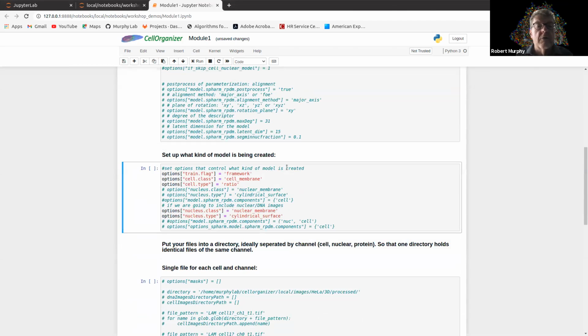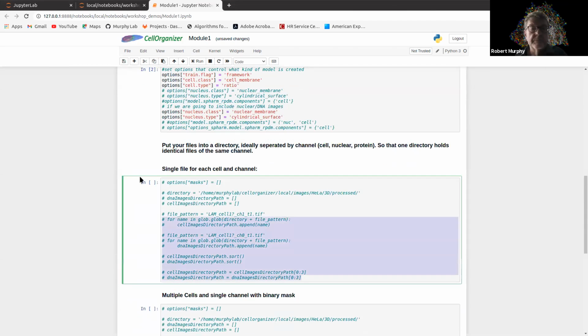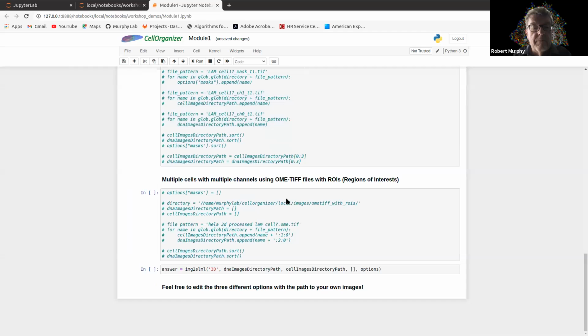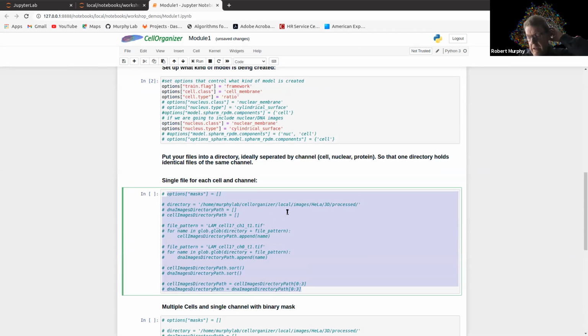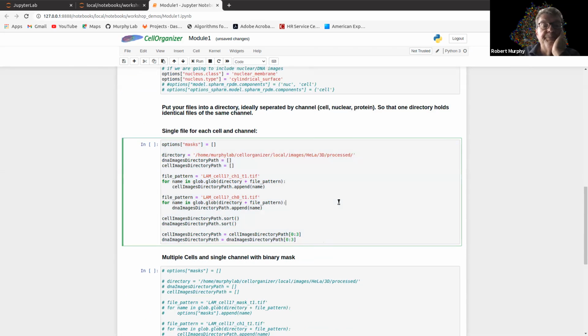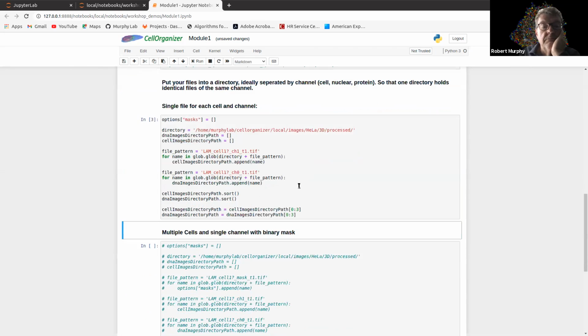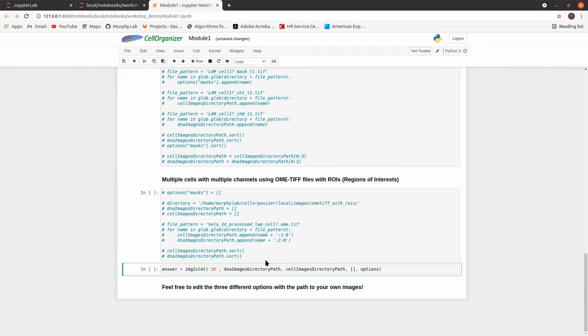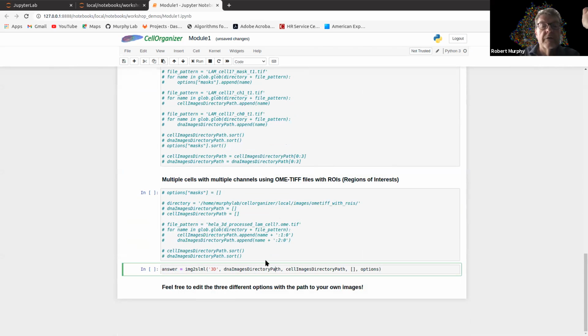You run all, go to cell, run all, and just run the whole thing. No, we already had, just run the one that, don't change anything. Okay, I realized that I had, yeah, you can uncomment one of the options, one of the ways of reading. You're absolutely right. I forgot I had done that already to mine. And then just run all, right? Are we going to show them the 3 different ways or just pick one of the ways? No, just run all on this now that you've set the first way. Okay.